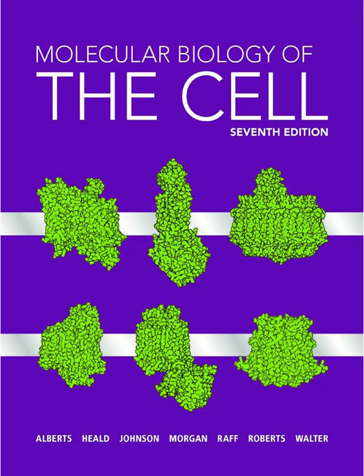It's like a very, very precise deli slicer using a super sharp blade, often steel or even glass, to cut those thin sections. And then you put those on a slide and stain them. Exactly. You can use traditional stains like hematoxylin and eosin, H&E, which give you general information about cell structures based on charge.